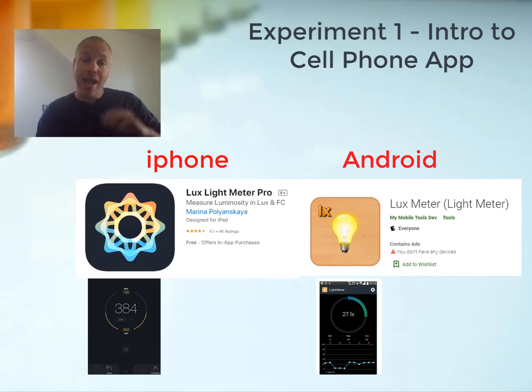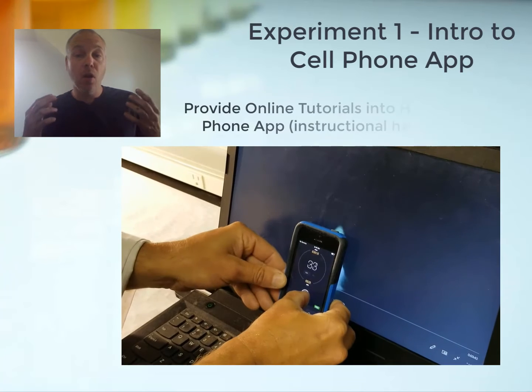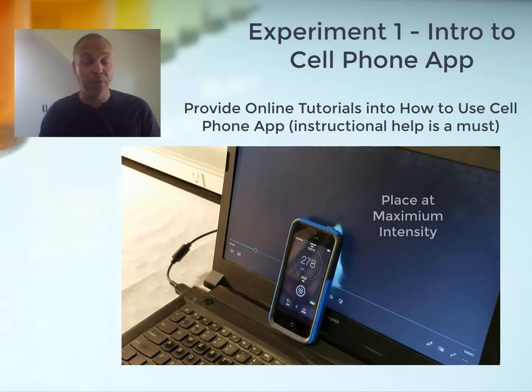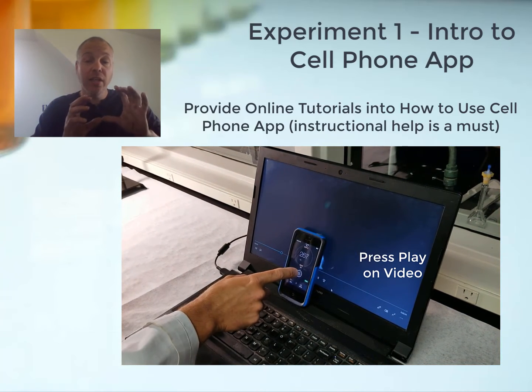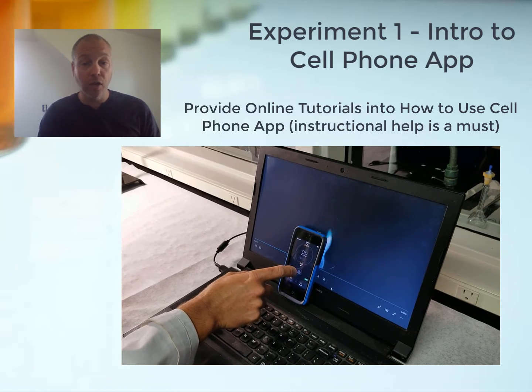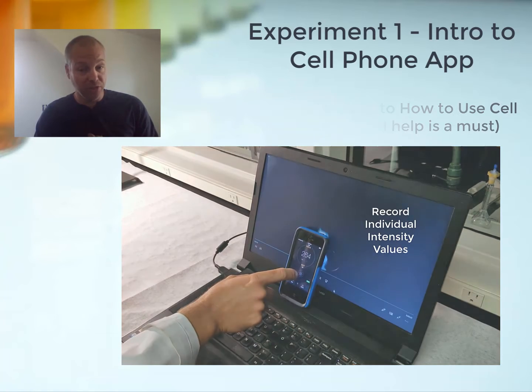So you could either download an Apple LuxMeter app or an Android LuxMeter app. Following this, we provided online tutorials for students how to actually use these LuxMeter apps on their cell phones at home. Students were provided tutorials on how to optimize and align their cell phone LuxMeter sensor on their cell phone with either a video that was provided online or images.